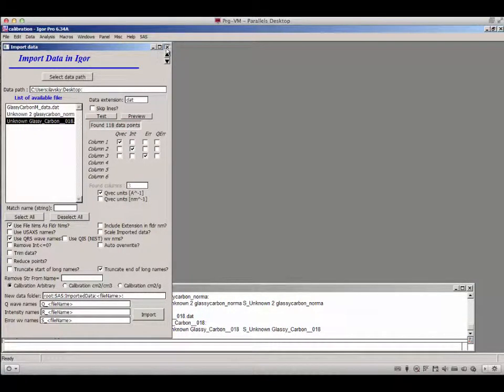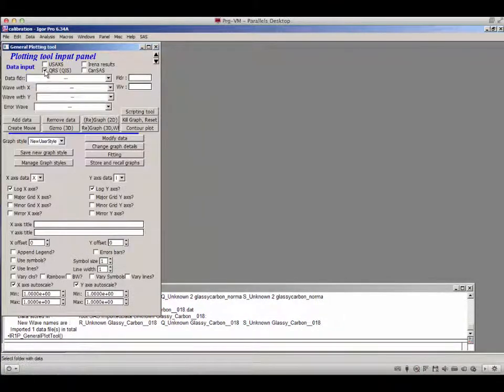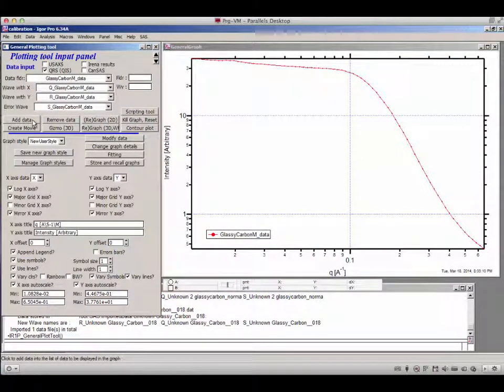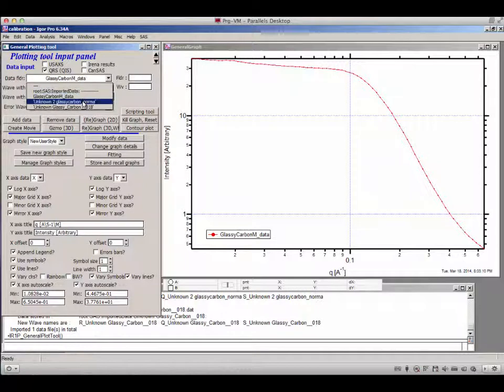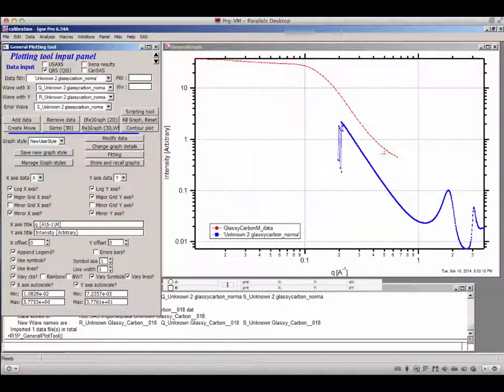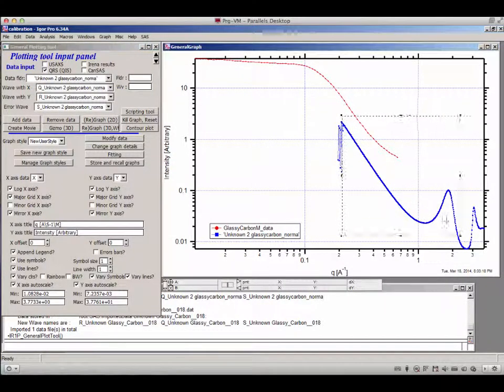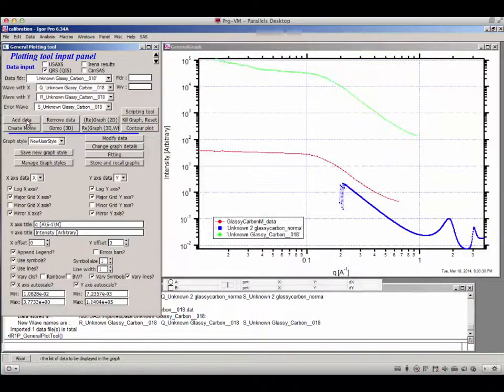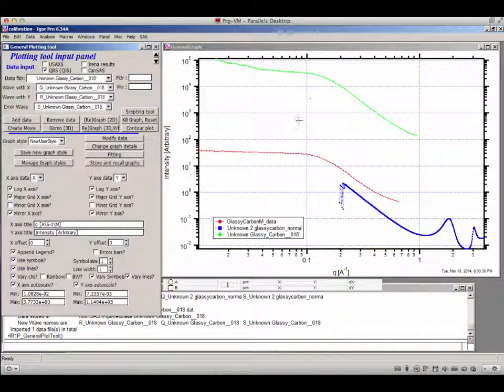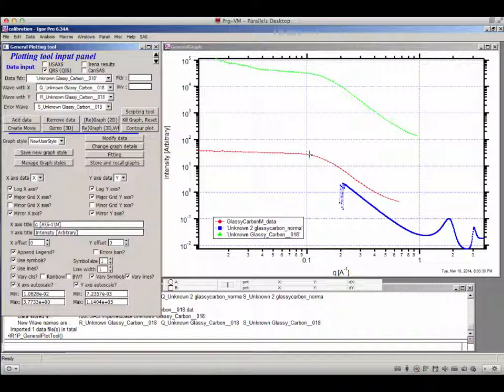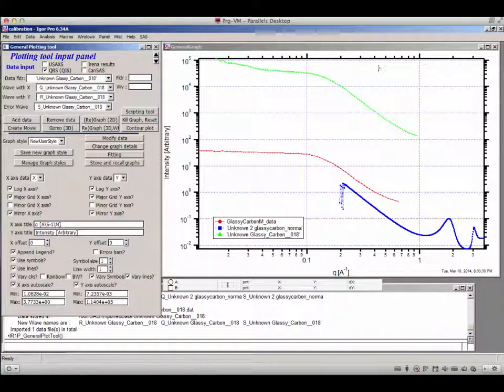Now let's look at the plots. We can plot these: the data on absolute scale is the glassy carbon measured by me, labeled 'glassy carbon M'. There is also an unknown glassy carbon extending over a wide range — this turns out to be wide angle scattering data so we won't use it as the first example. The next example is glassy carbon data on a relative scale collected with a different instrument.